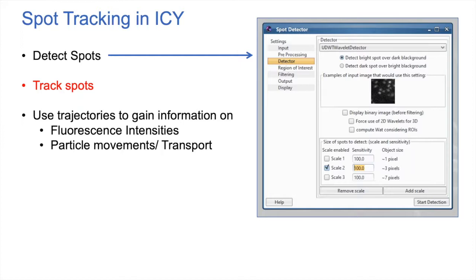Then you have these functions over here. These functions are useful for a 3D image when you do not sample more frequently. There is an optimal sampling in 3D to catch your object in more than 2 slices. When you can catch your object in more than 2 slices, the plugin will easily identify it. But when you do not do that, because you want to avoid photobleaching and you want to go faster, you can skip a few of these Z stacks and you will still see a particle in 1 or 2 of them, right?